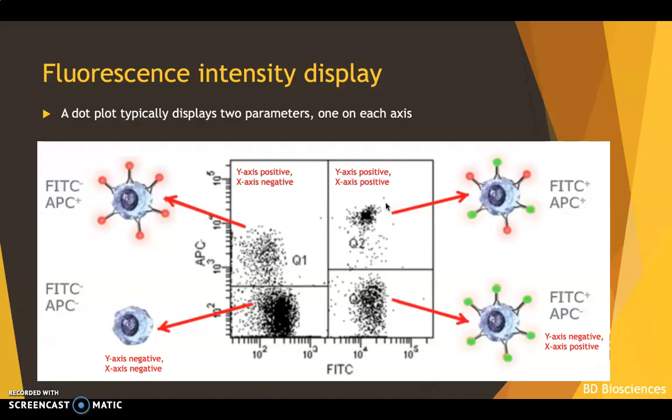I think that's about it. It's a very basic introduction. Of course, there are a lot more ways and complexity in analyzing flow cytometer data. There are also various applications that we can use, which we haven't touched. For example, we can test for cell cycle analysis. We can test for cell apoptosis capacity, and so on. There's almost limitless application that we can use the flow cytometer for.